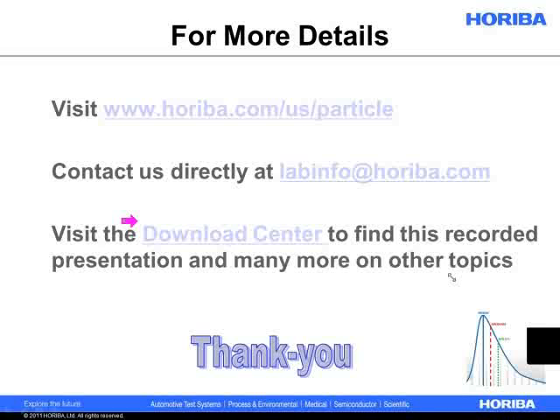A different way to say that is, it's much less likely that the needle is going to be seen head-on, from the narrow end only, by the laser beam than in some other much longer projection. So you're going to get a very wide distribution. Sometimes we've seen people come up with a bimodal distribution where you have a very narrow, small peak and a very wide, larger peak. And in that case, it actually is reporting the head-on distribution.